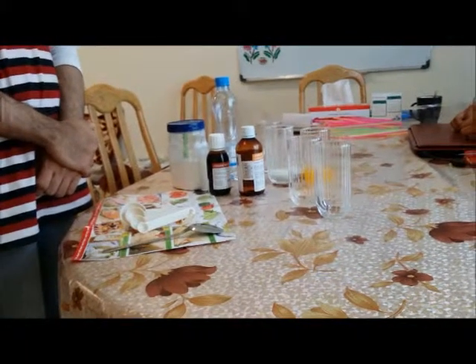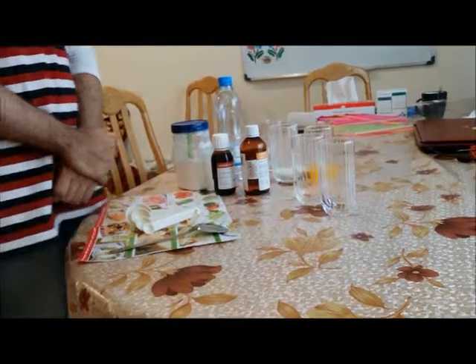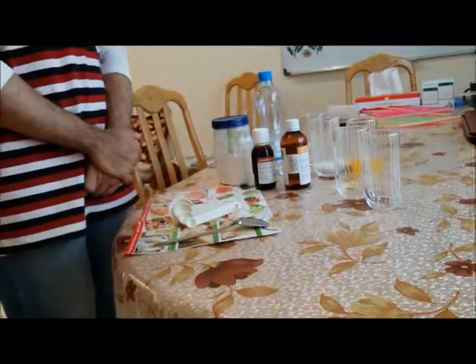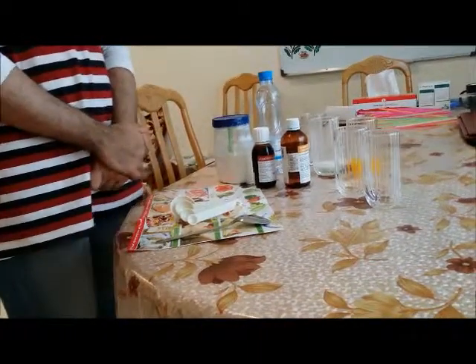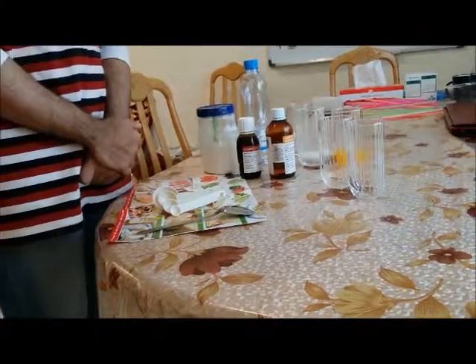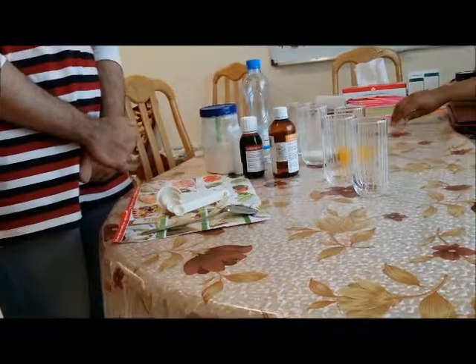Hi dear students, today we will be learning to do the iodine clock reaction. It is a very famous experiment which has been done up to now in many schools and laboratories. The purpose of this experiment is to teach students about the kinetic theory of molecules. It is a very famous lesson in physics and chemistry.